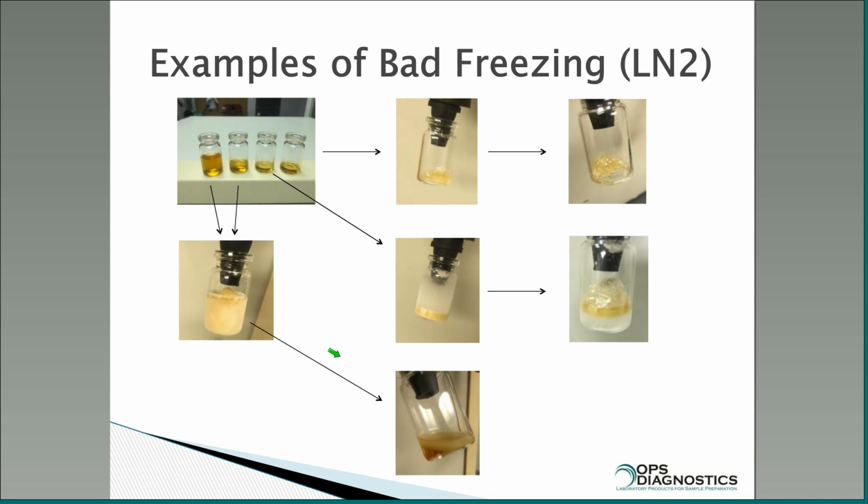Down here, since there's such a distance for the water to go through, this will start off and look fine, but over time all of a sudden it will melt down and it'll turn into a liquid, what we call melt back. And in this particular case, water is being drawn off. It's just going from liquid to gas, and you actually end up with a skin forming due to proteins and stuff accumulating as the water is being removed.